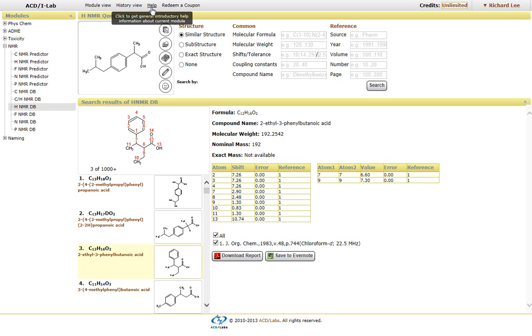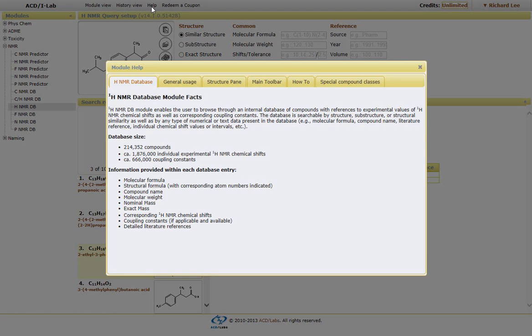Now, if you want some more information with regard to how our databases work with regard to number of entries, just simply have to click on help, and you can see the number of database compounds that are placed within the NMR database.